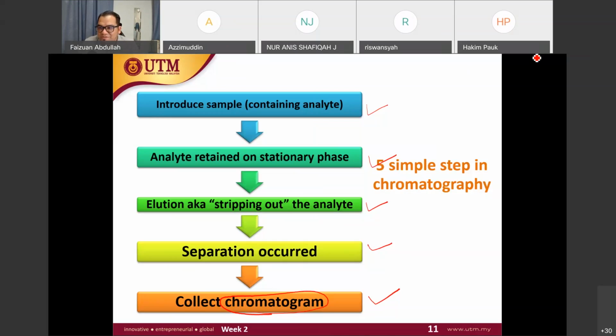Ifan. Oh yes, we teach the instrument. How do we teach the instrument? Yes, calibrate using a known concentration. Thank you, Rushdan. Give a big clap to Rushdan. You can clap in the Webex, right? You know the clap button? There, give a green clap to Rushdan. Yes, we have to calibrate.